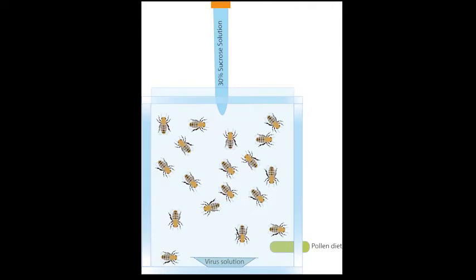One of the ways that we use these cages a lot is to do experiments looking at virus infection in honeybees. We do lots of different iterations of these where we might look at how co-exposure with virus and a pesticide affects survival, or how different diets affect bees' ability to resist or tolerate infections, or how behavioral changes might occur in infected bees to cause transmission to increase. And so, like I said, this is done quite a lot.